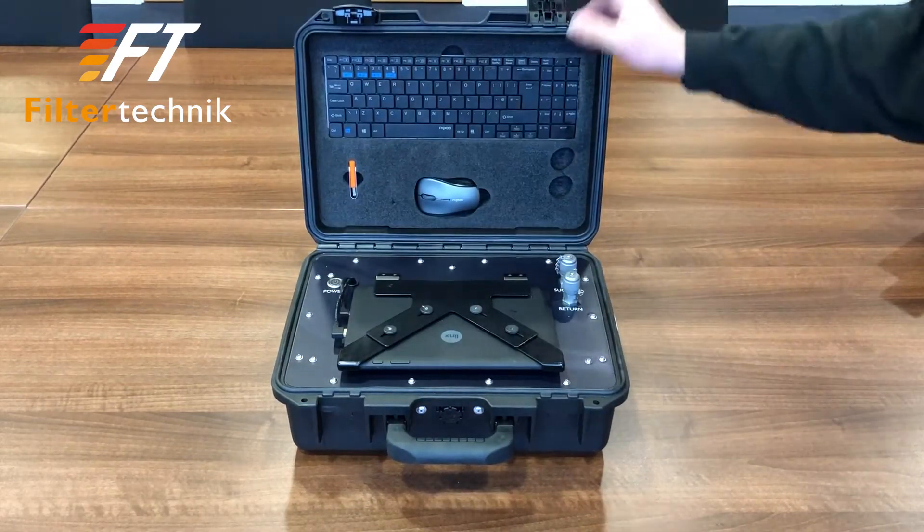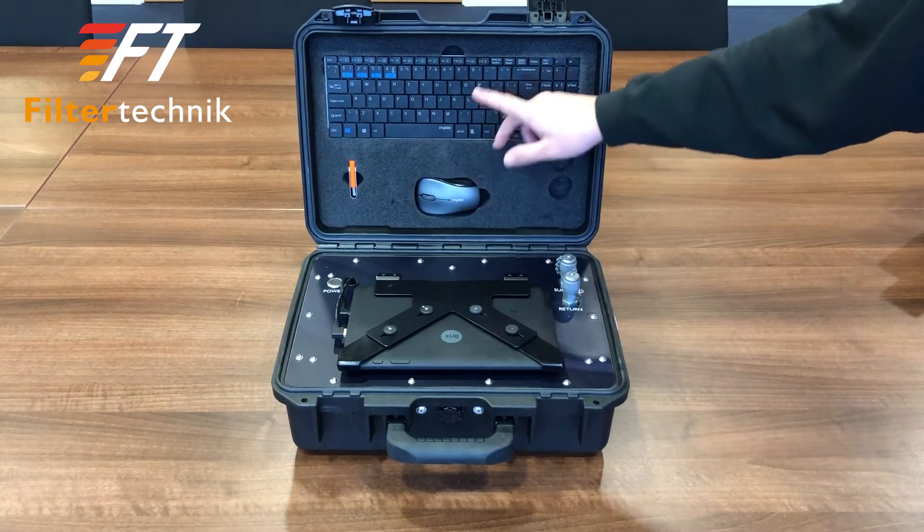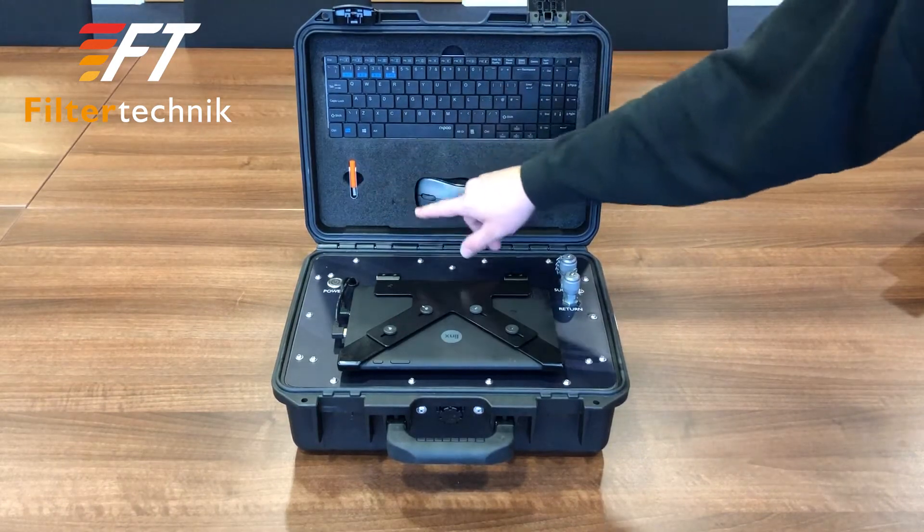Inside we have the tablet, the sample points, the mouse, keyboard, USB stick and allen key.